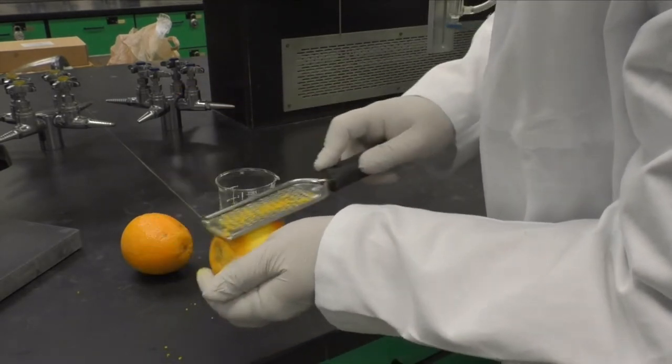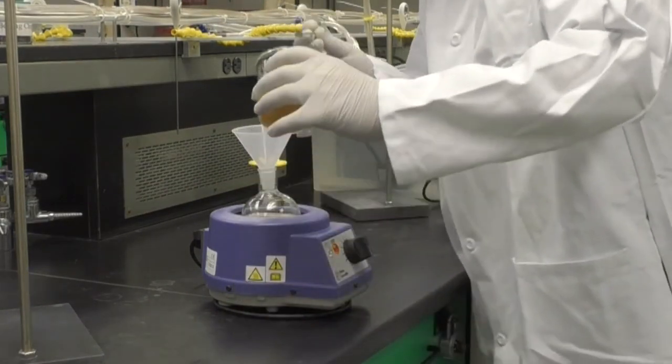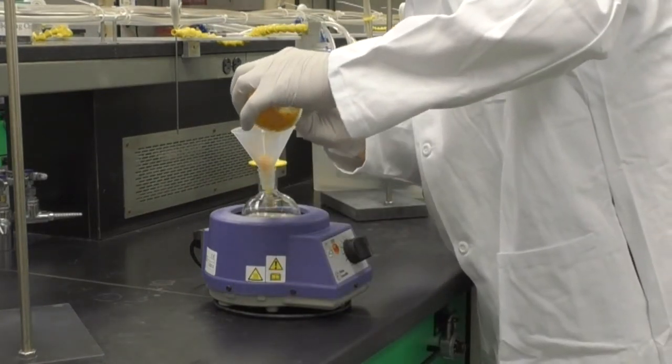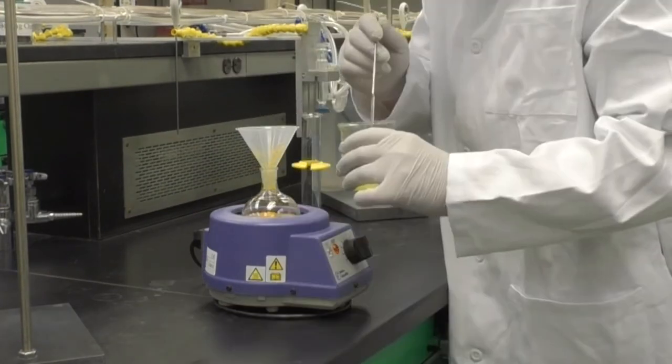With the flask in the heating mantle, use the powder funnel to transfer the zest into the round bottom flask. Then add a few boiling chips and 125 milliliters of water.